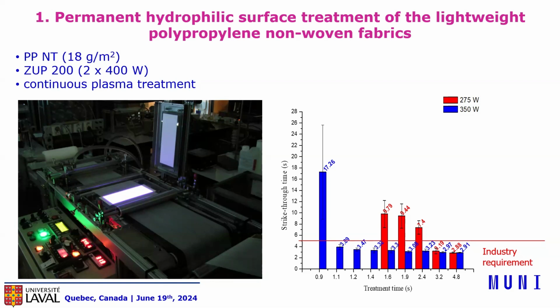And when you put the salty water there, it is conductive, so there is an electrical circuit between the stopwatches and that hole where the salty water is. And when all the salty water has gone through the textile to the filter papers, the circuit is switched off, and the stopwatches stop counting the time. So there are two reasons. One, according to the norm, it should be a solution similar to physiological liquid. And the other is, from my point of view, technical: this is the way we measure that time.